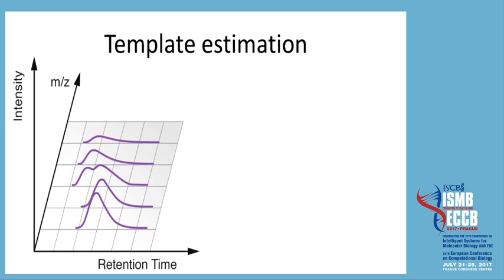So that was the model, and given the model and the observed XIC cluster, we want to obtain the quantities. Before that, we first estimate the template per label, and the 3 elements, position, XIC shape, and isotope distribution, are to be estimated.